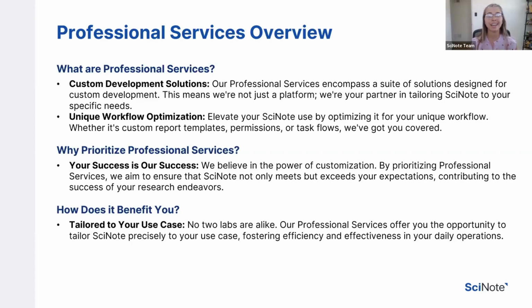We recognize that no two labs are the same, or no two companies or workplaces. No one operates alike, so why should your ELN or your notebook operate exactly the same? For example, your reports, your team roles, permissions, your task workflows, we know they're all different. So we're here to help you make them align with your team.